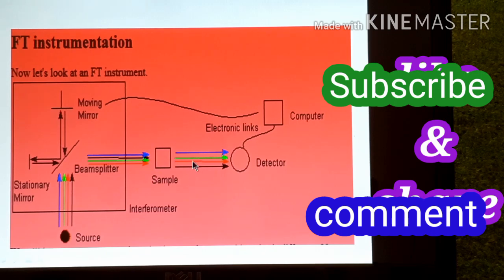The system must convert this time energy domain into the frequency domain, as frequency is required for the construction of spectra. So here comes the complex mathematical calculation, which is the Fourier transformation. When the Fourier transformation occurs, and the time energy domain is converted into the frequency domain, these results are required for the ultimate construction of spectra. When these radiations reach the detector, it detects them, and the computer screen shows us the spectra in the form of results.